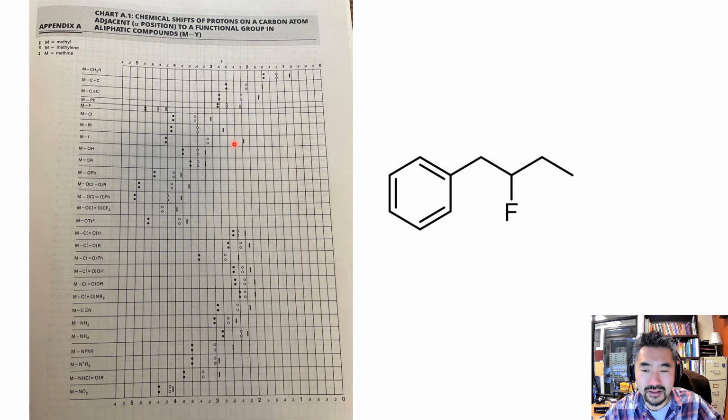So for those of you who have already gotten started, especially on sketching the predicted NMR spectra and whatnot, this is probably useful to you. But I'm sure you've seen the elementary chemical shift tables in the OChem textbook or the ones that come in your OChem lab manual. Those are useful when we are beginning, but this is really a lot more useful in actual practice. So I just wanted to go over that with you real quick.